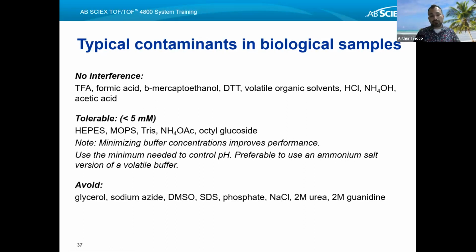But please avoid the following. Avoid glycerol. Glycerol is typically used, especially in the storage of proteins, but avoid it. Also avoid sodium azide and DMSO. That's why I emphasize that if anyone needs to bring samples made in DMSO or DMF, do it at very high concentration, because we're going to have to dilute it.